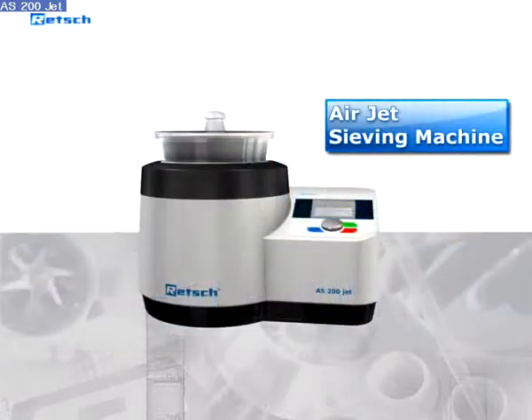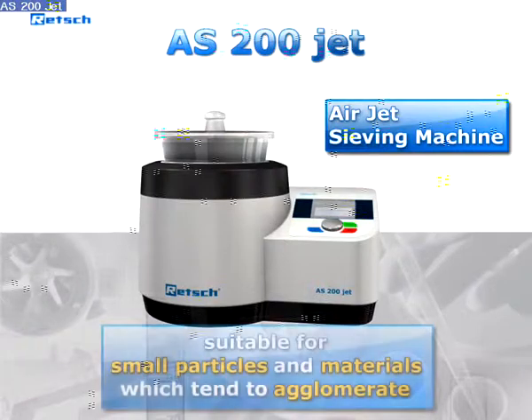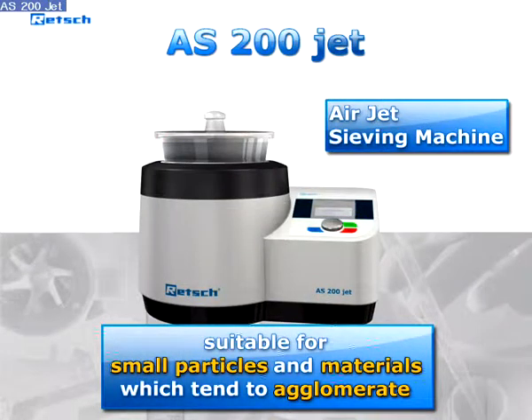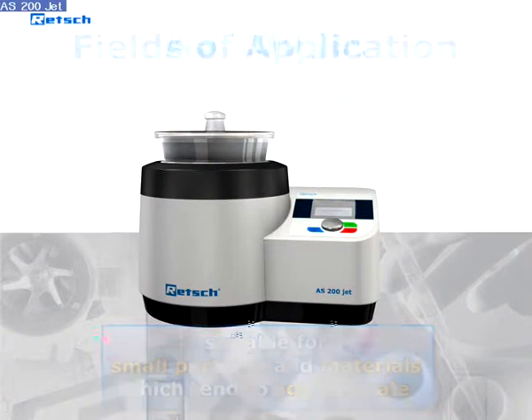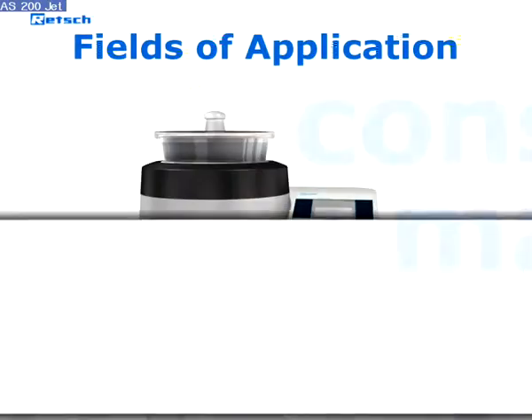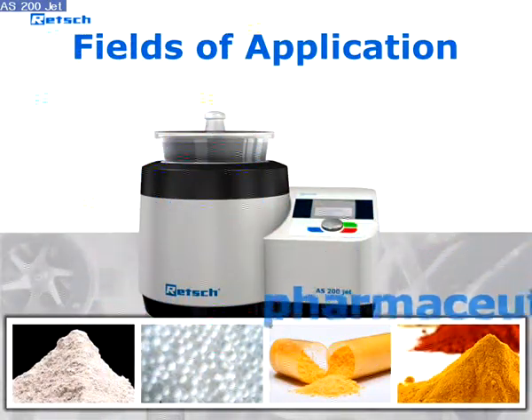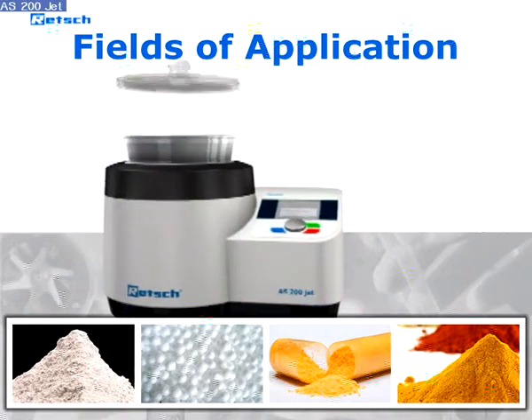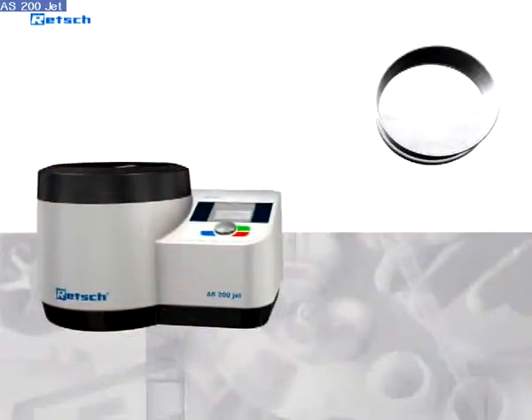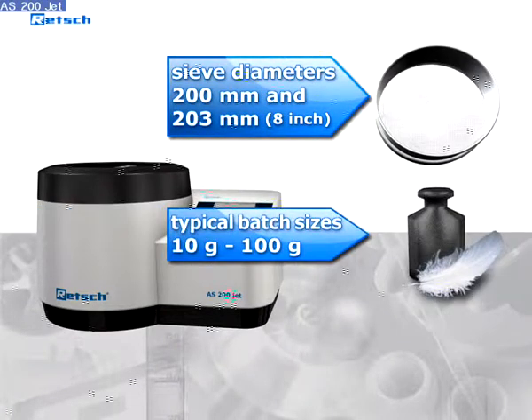and makes our air-jet sieving machine AS200 Jet the optimum solution for perfect quality control. The AS200 Jet is particularly suitable for small particle sizes and materials, which tend to agglomerate. Therefore, the sieving machine is primarily used in the following fields of application: construction materials, especially cement, plastics, pharmaceutical products, food. The AS200 Jet works with standard sieve diameters of 200 and 203 millimeters. Typical batch sizes range from 10 grams to 100 grams.